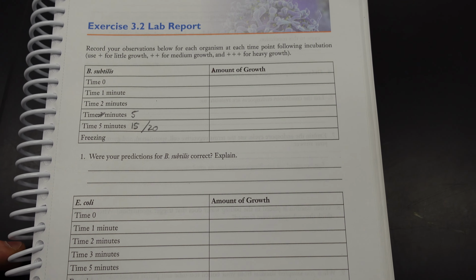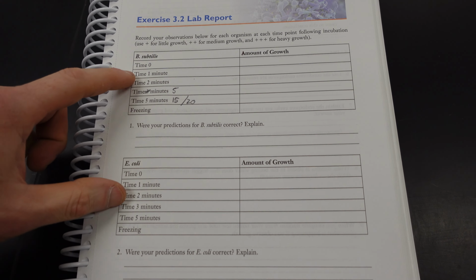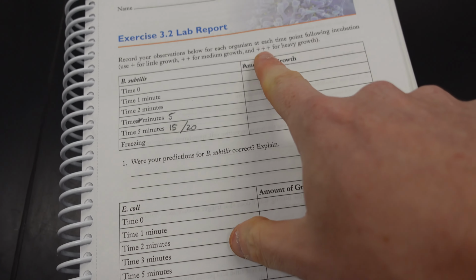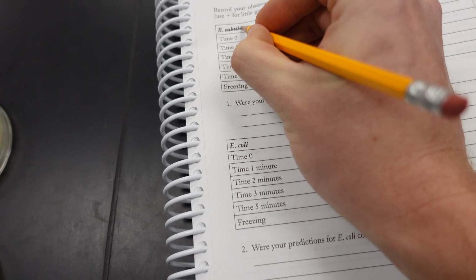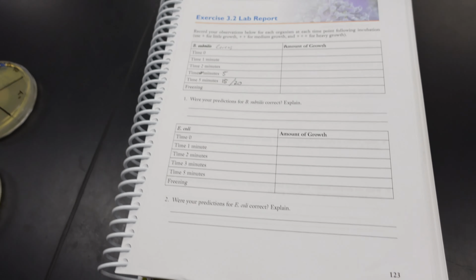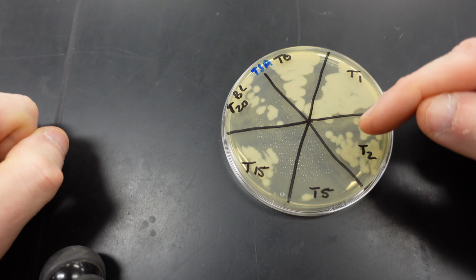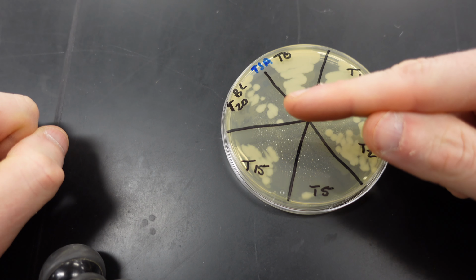All right, so we're going to look at the lab report for lab 3.2, look at the results, and we're going to change some of these times from 3 to 5 minutes total, 15, and then 20 minutes. And what you'll do is record pluses for the amount of growth. And we are also going to use Bacillus cereus as our organism to begin with. So here we have our time 0, our time 1 minute, time 2, time 5, 15, and 20.